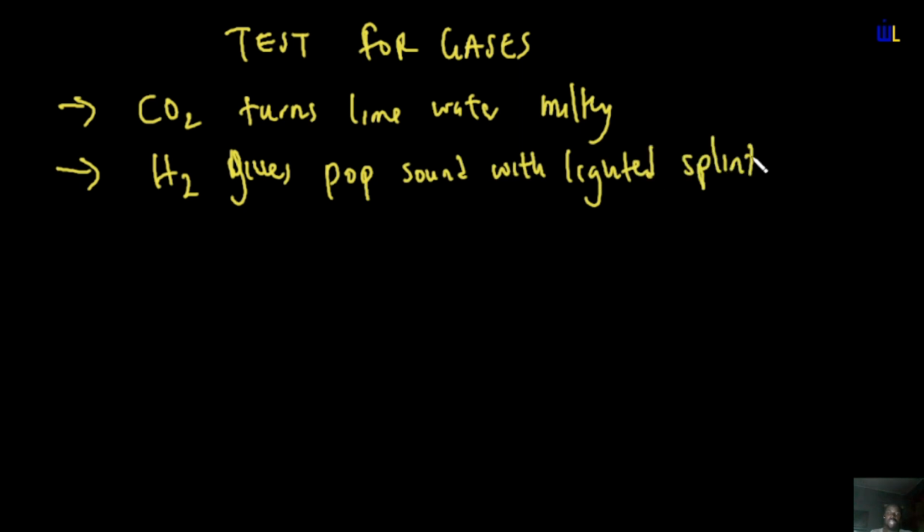And when we say lighted splint, it's not so complicated. It's just like a piece of broken wood that is on fire. You get what I'm saying? Once you introduce hydrogen gas, it extinguishes the lighted splint with a characteristic pop sound. I don't know if you heard that, but you know that sound. That's the pop sound. Okay.